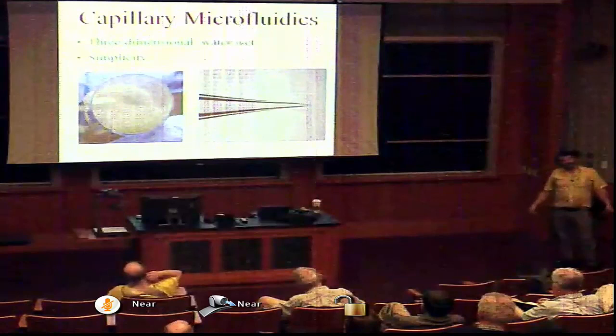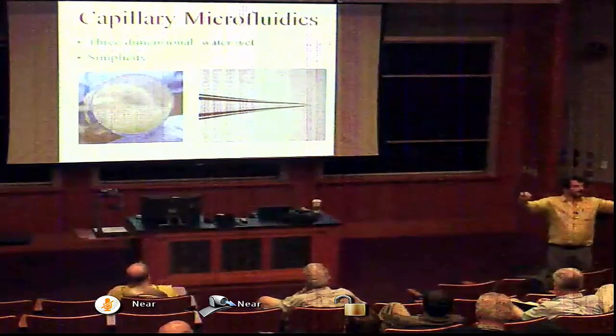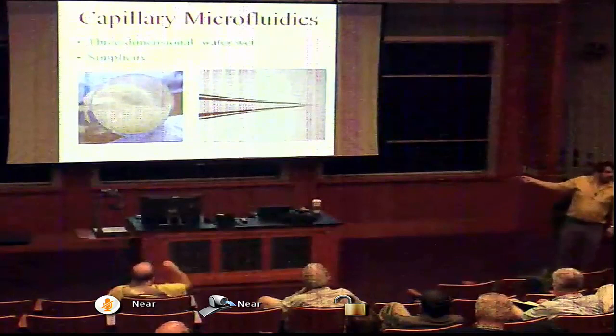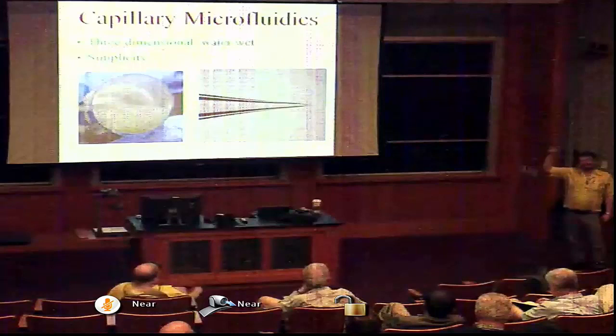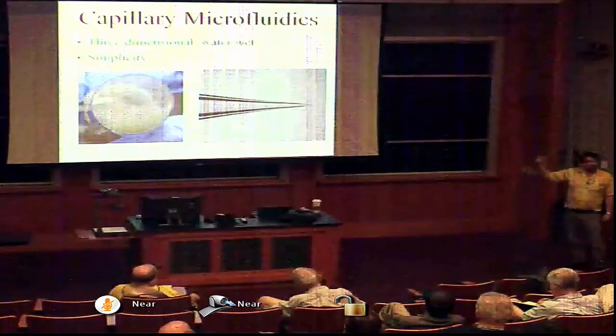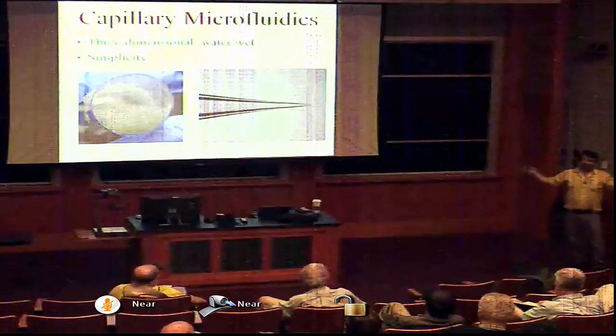If they're glass capillaries, what you can do is heat the middle until it's very close to the melting temperature of the glass and then pull it. Pull it till it breaks. And you get this very narrow shape here, this point, and there's a small orifice. I'm going to show you a microscope picture. This orifice, you start with half a millimeter. It can easily be a micron in diameter. We typically work at a few microns in diameter. You can control the size and the shape very precisely and very reproducibly. In fact, in the biology department, they have machines that just control the heating and control the pulling, and you can do it every time exactly the same way.